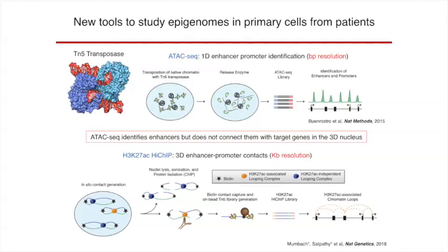So I'll come back to ATAC-seq in the second part of the talk, but I think this has really been a revolution for immunologists because you can now take this type of measurement in primary cells. Now you can see what's happening in the other 98% of the genome. So you can do this in 50,000 cells in the first iteration. I'll show you later we've now taken it to the ultimate resolution of single cell detection.